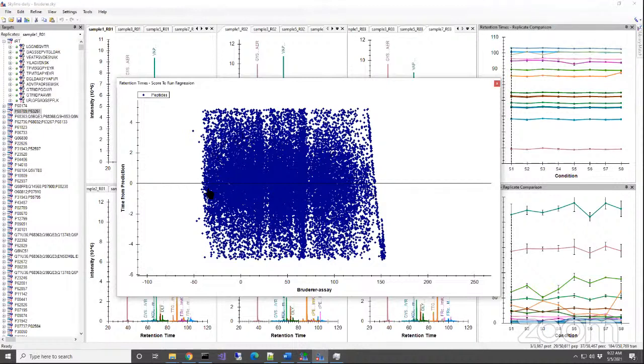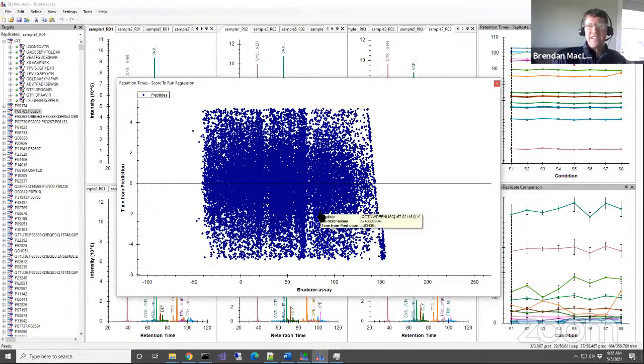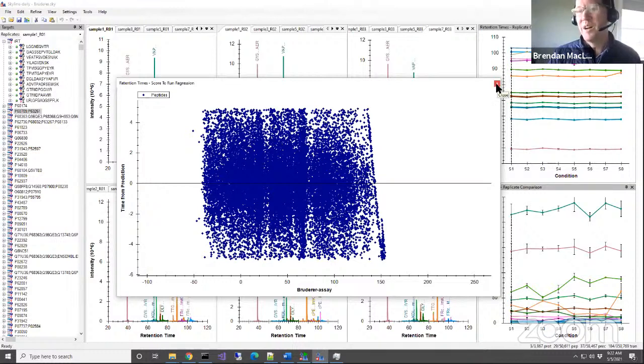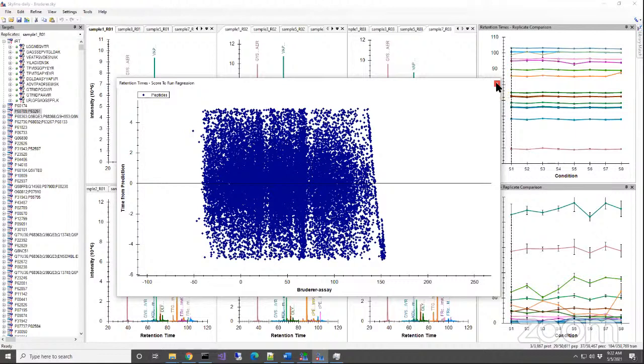These are the peaks as they were picked based on the score weighting that we came up with. But everything here looks really great. We should feel pretty good statistically about how we processed this data.